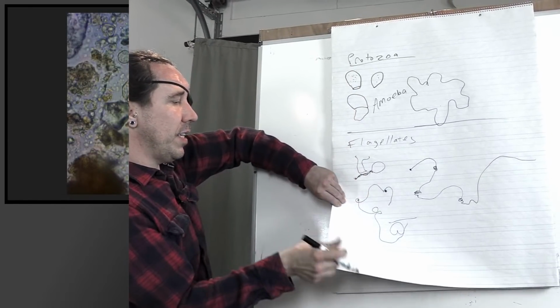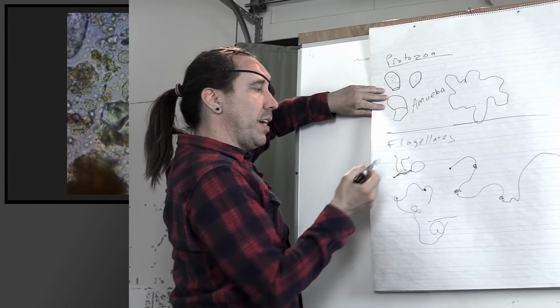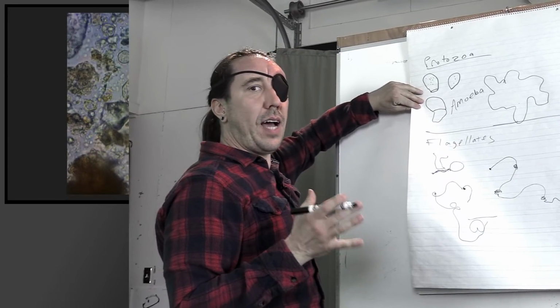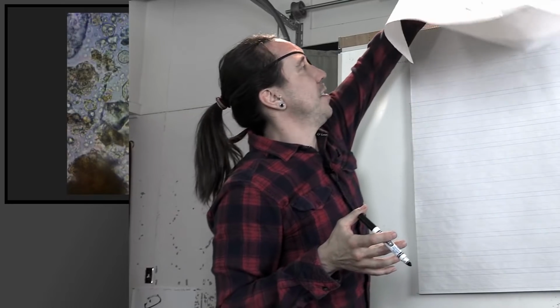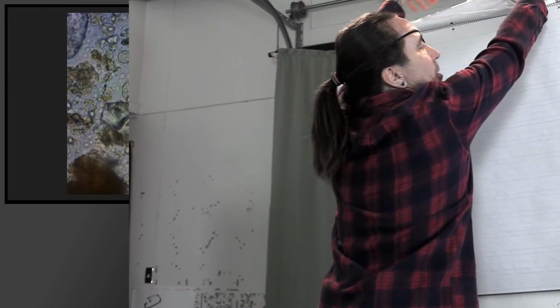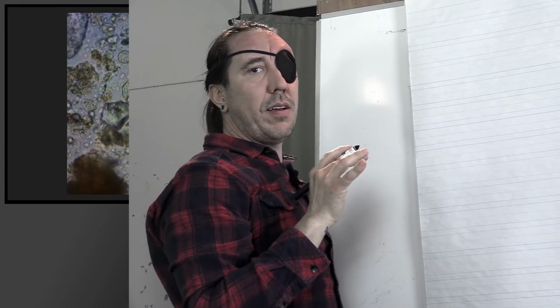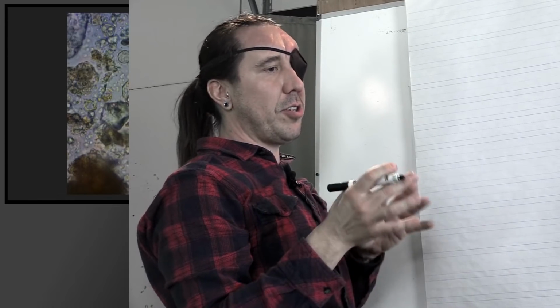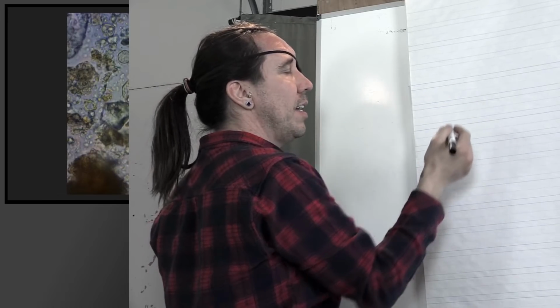So protozoa, flagellates, and ciliates. We're hoping to see protozoa and flagellates. Ciliates are a sign of low oxygen or anaerobic conditions, so we're not wanting to see ciliates, but that can show us that we have a sample that is having some issues. Ciliates are generally going to be much larger than flagellates. There are some species of larger flagellates that look similar in size to the smallest ciliates, but generally ciliates are going to be rather large in size.